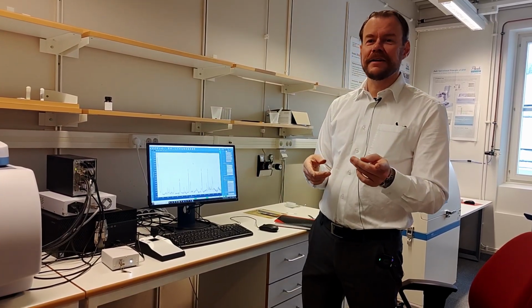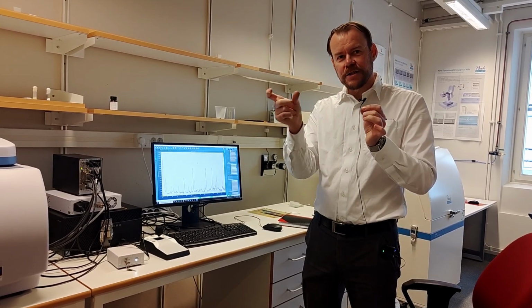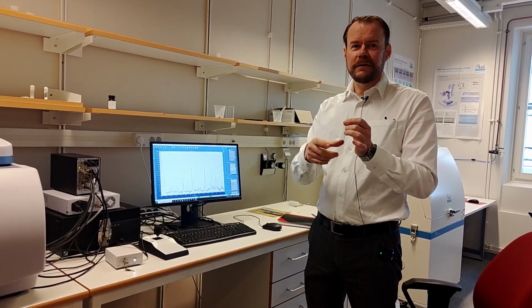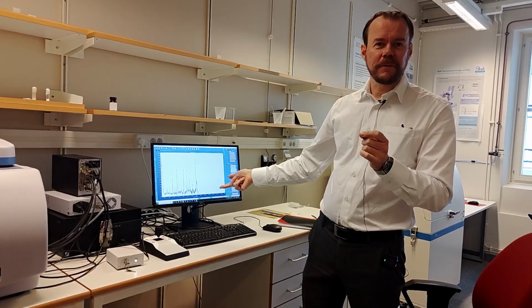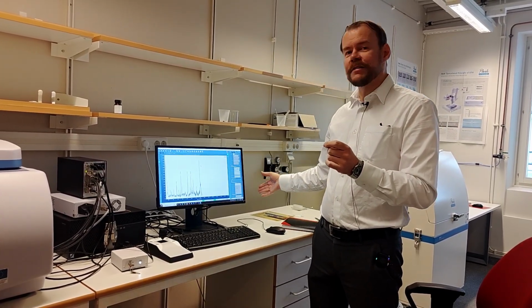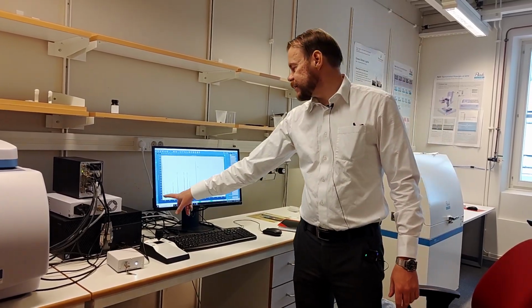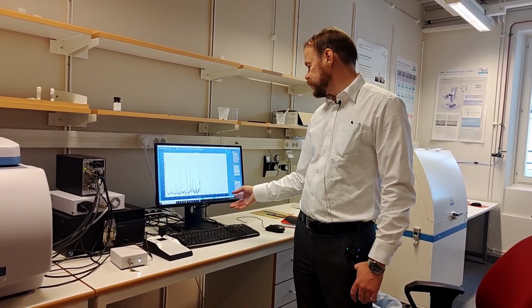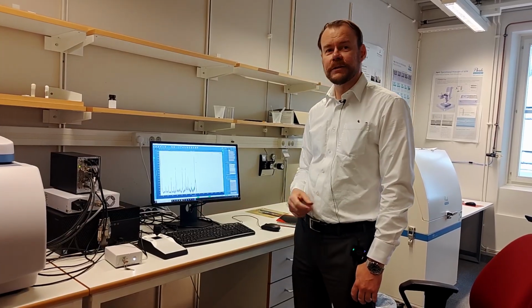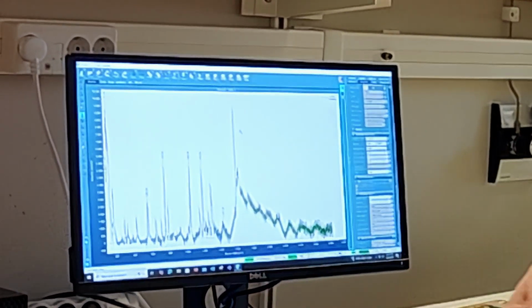The drawback is that for each scan section it does, it adds some new scan time, right? Because if you have a very high grating here, then it will be like 5 sections or something, and then it will take 5 times longer also. So here we can see the first part of the spectrum now, and now it's doing the second part. So then we'll see the continuation there. Yeah, so here we have the second part now.